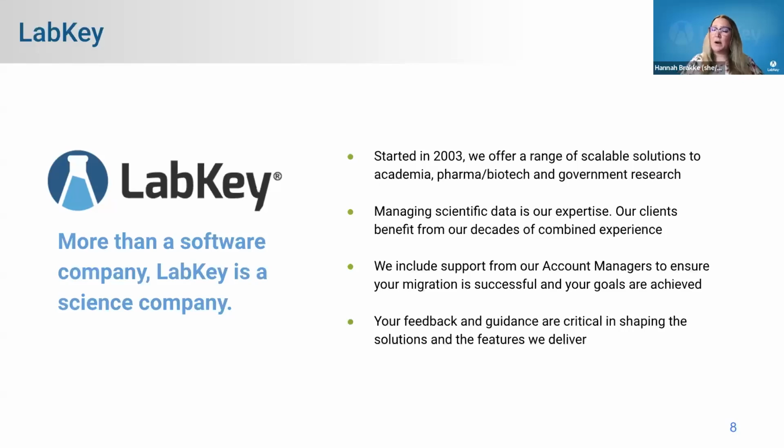Okay, great. I see a question here around how do you know when your lab needs a pre-LIMS solution versus a LIMS solution. Really what it comes down to for me is what are the budgetary constraints that your lab may have, and what pieces are you struggling with? What are those pain points? If you are really struggling with the basics of capturing the right metadata on samples, or finding samples within the system, you may be able to start with those pre-LIMS solutions that really help you get started before you move into a LIMS. So again, looking at those and thinking about what solution is right for you. Obviously, we're happy to have those discussions, and other vendors should be having those discussions with you as well, of really what's needed at this time versus what might be needed in the future.